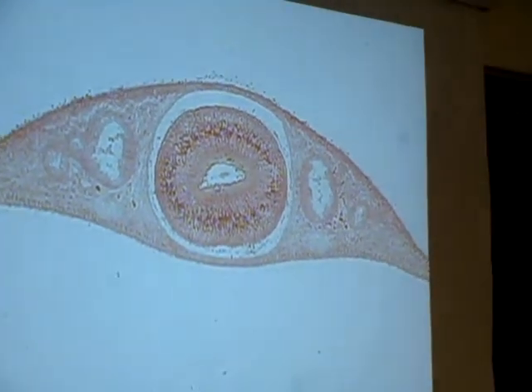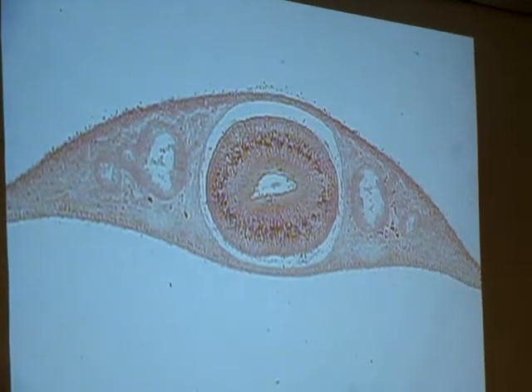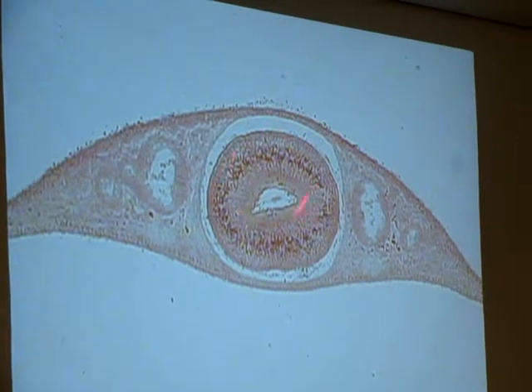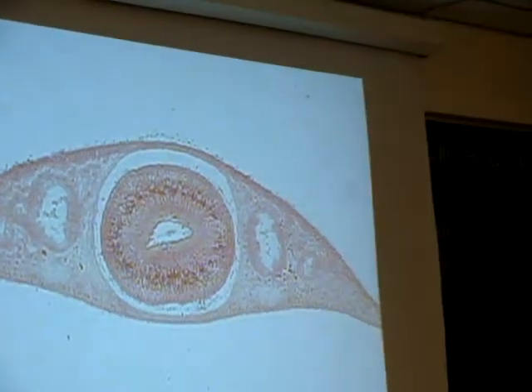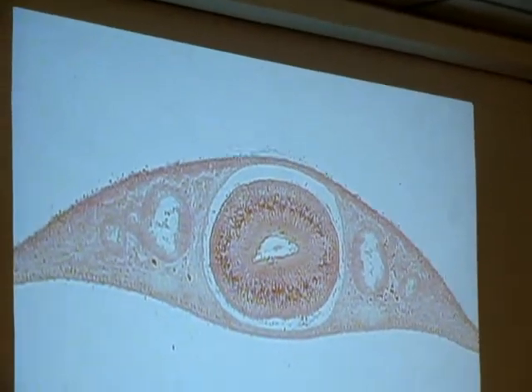Name this organism. Okay, so this is a cross section, yes? So what's the large object here? Pharynx. Space is the pharyngeal chamber.